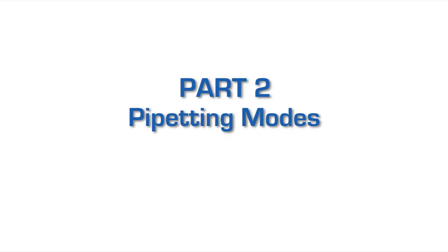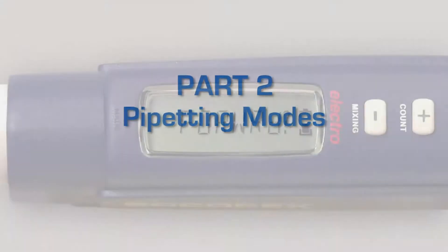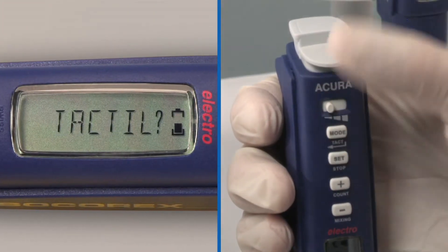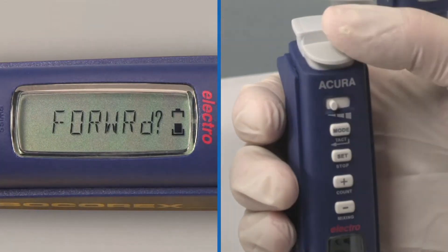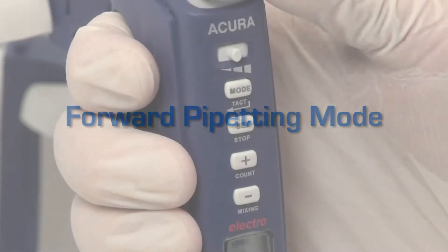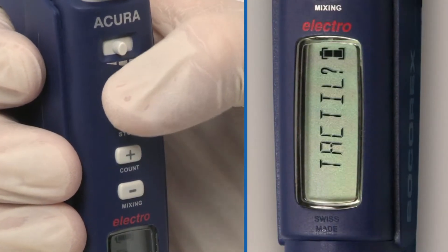Microprocessor-controlled instruments feature intuitive software avoiding any complicated programming steps. No particular skills are required to get quick access to six working modes, and there are many volumes to select from. Scroll through mode selection by pressing a single button. Forward mode corresponds to aspiration and pipetting of a set volume. It is suitable for all applications in the lab. Press mode until the display shows forward.